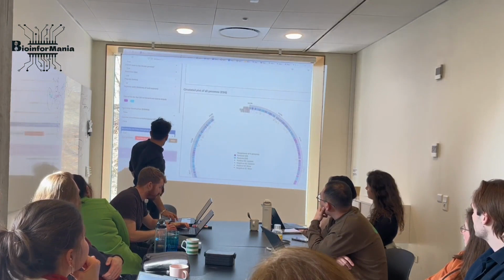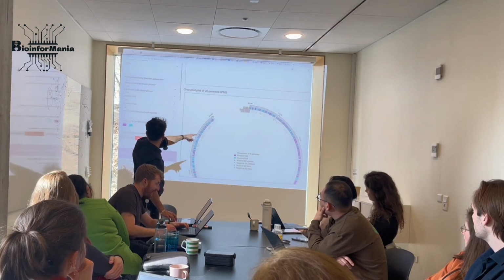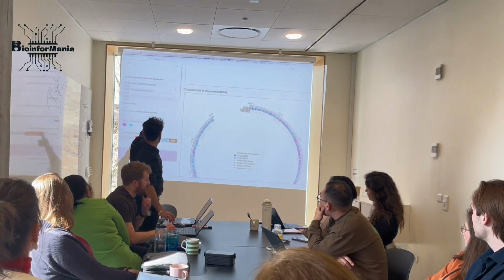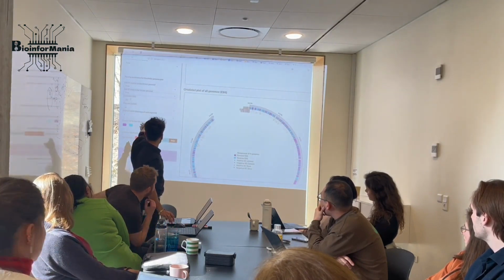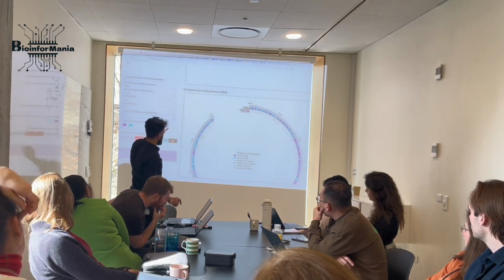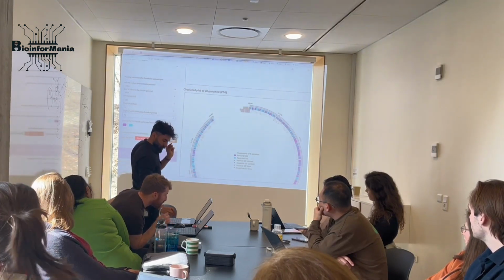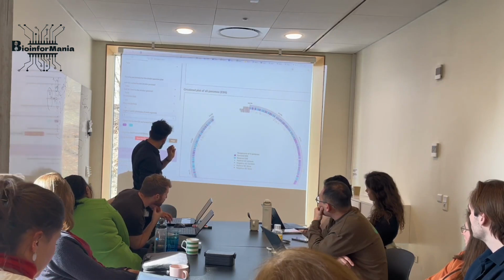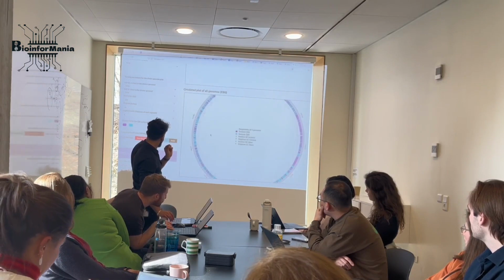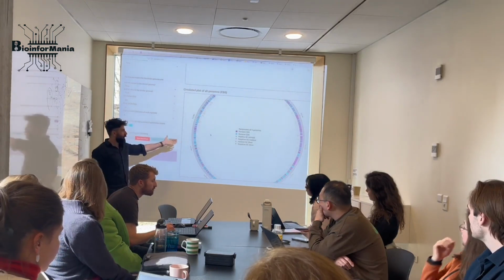How to do this. This segment is tuning parameters for this guy. So, do I add GC content? No, thank you. Do I add GC skew? No, thank you. Resolution 200. Plot size, that is okay, but increase the width of each genome to, let's say, 5, okay? And then we display the results again. Takes a bit of time. We display the results, okay? So this display result is for this guy.